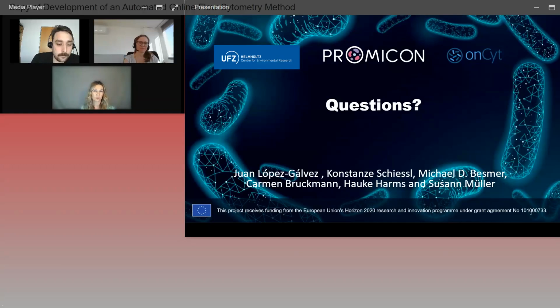Now, Juan, we were talking about strains. Why did you choose these 3 strains to make up your bacterial community for the experiments? I chose these 3 bacterial strains because these are bacterial strains that we used a lot in our working group, that we have a lot of experience with. We call them mock community because it's an artificial community that we made. And we chose these 3 bacteria because they have different characteristics.